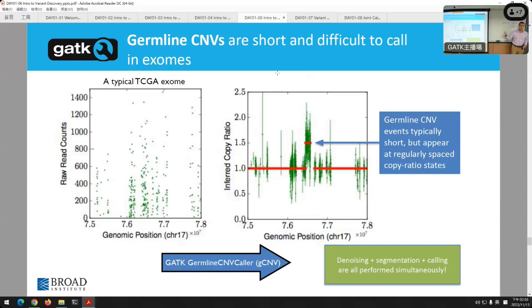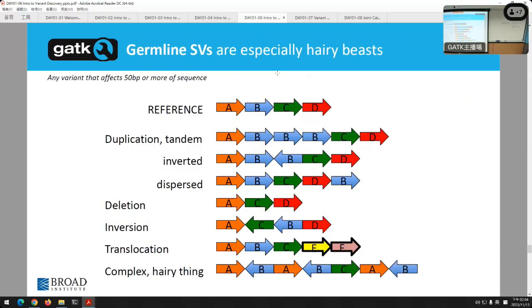Okay, but in the germline case, if you have made it to adulthood, most likely you have CNVs, but they're not that crazy. They're usually smaller and don't affect too many cells. Otherwise, you wouldn't be a viable embryo. Okay? So because these are smaller, again, you have an exome. So you're only seeing coverage every so often, and you have these small events. They're very hard to detect. The signal is very small. Not a lot of noise necessarily, but not a lot of signal either. And so it's a whole different problem. And we'll teach you all about that on Wednesday.